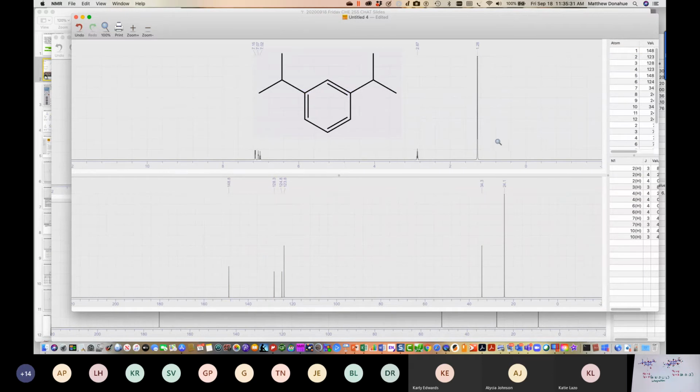So in the top spectrum, I'll do the same thing. The methyl groups are highlighted. So there's your 12, then your methine, that's your 2, then you have 1 on the aromatic ring, the second one on the aromatic ring, and then your other 2. So that's your total of 5 that you see, and then there's this ratio. When you actually look at the data, it's called an integration. So let me show you, let me draw the other one now.